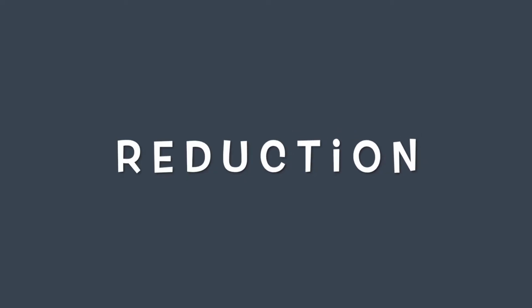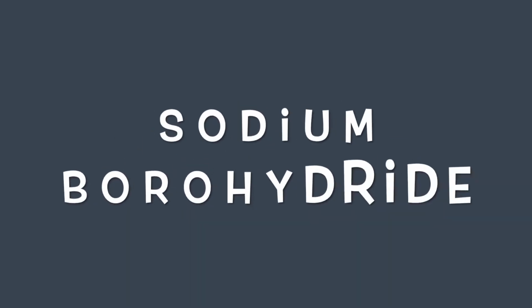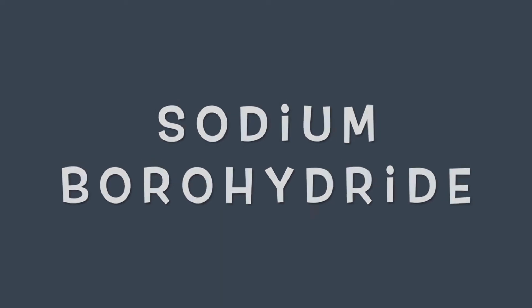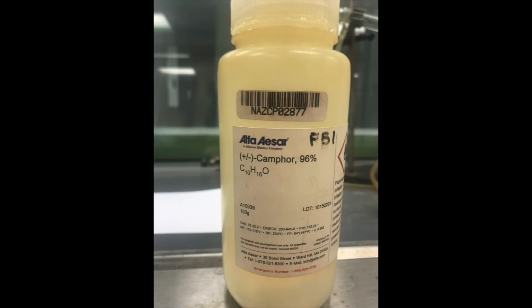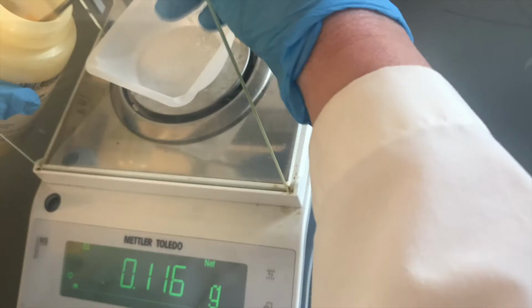In this reduction reaction, we have decided to use sodium borohydride. It is much easier to use than lithium aluminum hydride and definitely gets the job done. In this step, the hydride can approach the camphor molecule from both the top or the bottom, and it turns out it's easier from the bottom side. Those two methyl groups off the top sterically hinder the exo approach. Although we do get both products, part of this lab experiment is for you to determine how much of each isomer we do obtain.